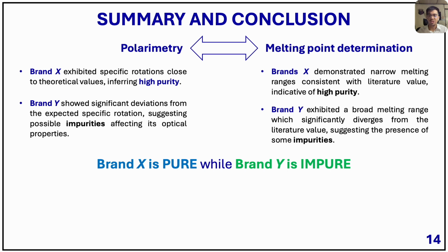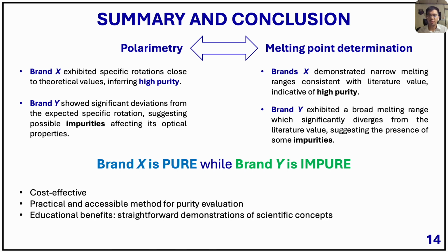This comprehensive approach combining polarimetry and melting point determination proved to be cost-effective compared to other devices. This offers a practical and accessible solution for purity evaluation. Furthermore, the non-black box nature of the polarimeter facilitates a straightforward demonstration of optical activity and polarization concepts.